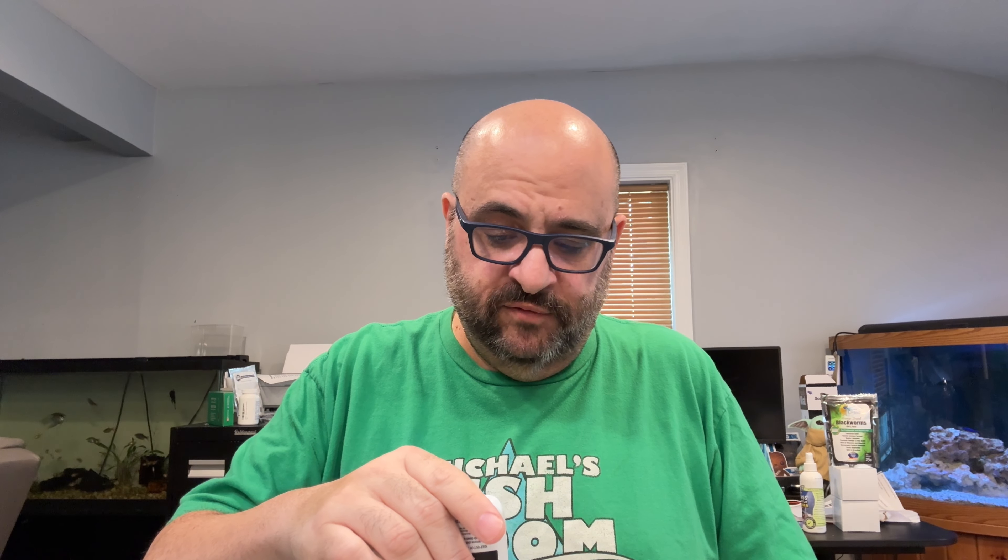Welcome back fishy folks — yes I've changed my shirt because it's about 24 hours later. When you have open heart surgery and you're only two weeks post-op, you get tired quite easily. After talking for about 10 minutes yesterday I was pretty tired. For you it's only been 30 seconds; for me it's 24 hours. The ammonia test came out good. Now we're going to do the three remaining tests: nitrite, nitrate, and wide-range pH, all together.